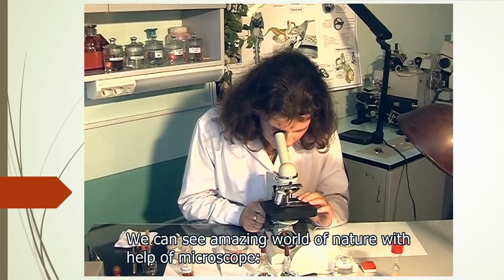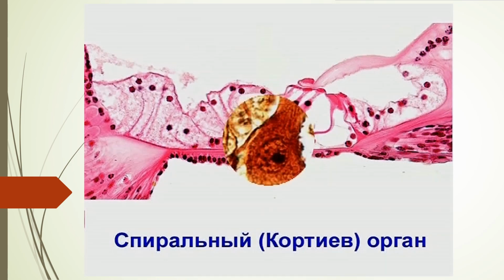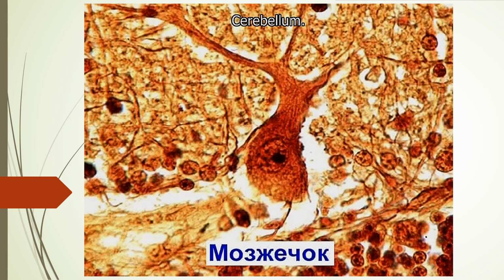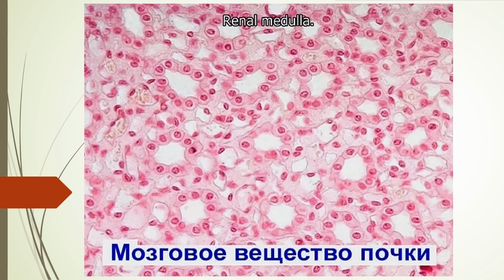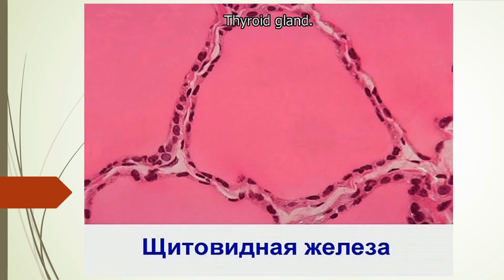We can see the amazing world of nature with the help of a microscope. Spiral organ. Cerebellum. Renal medulla. Retina. Thyroid gland.